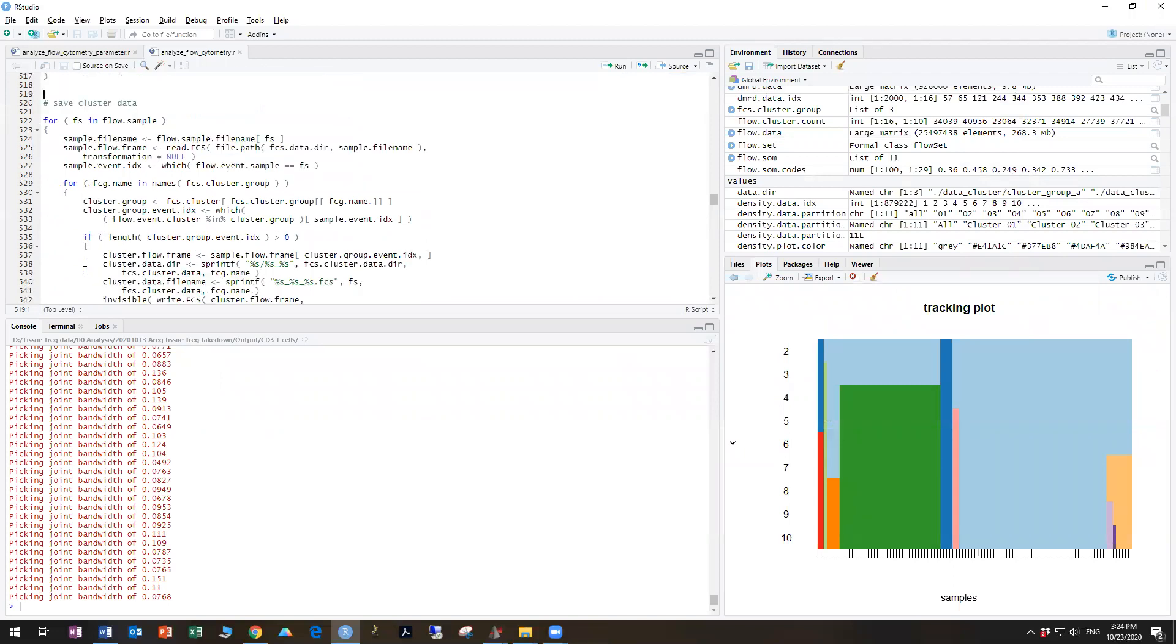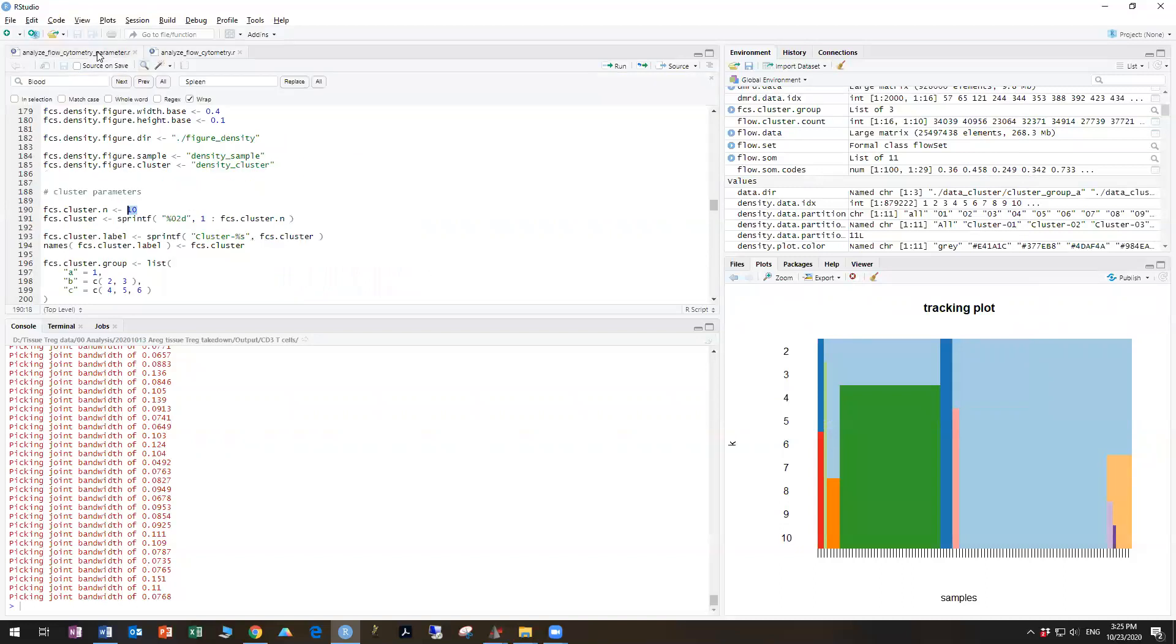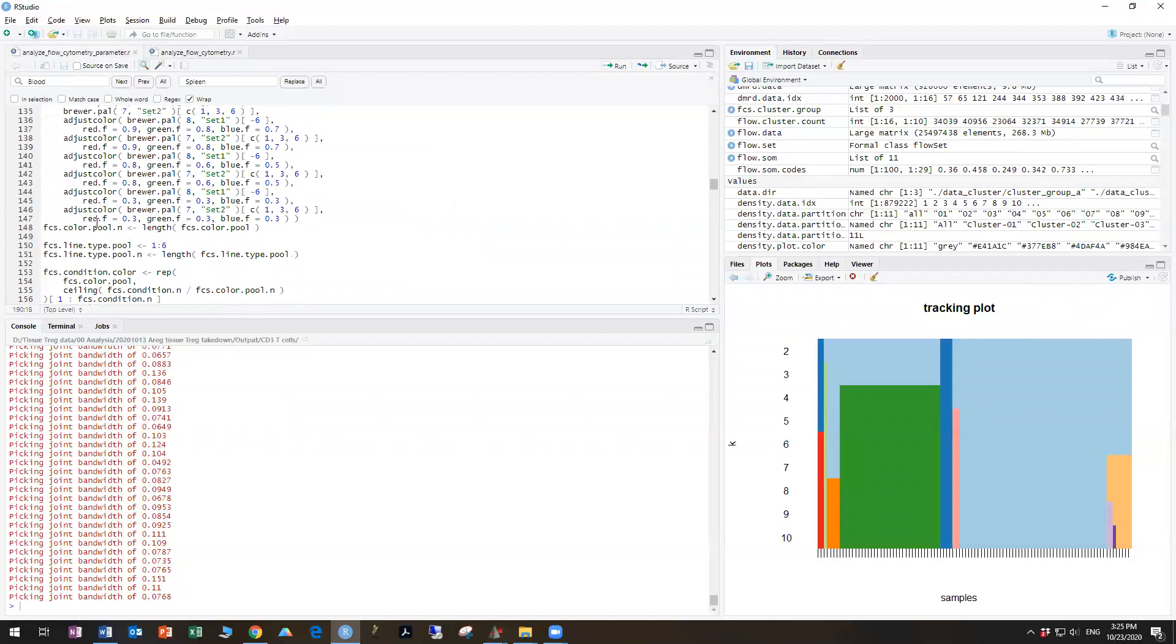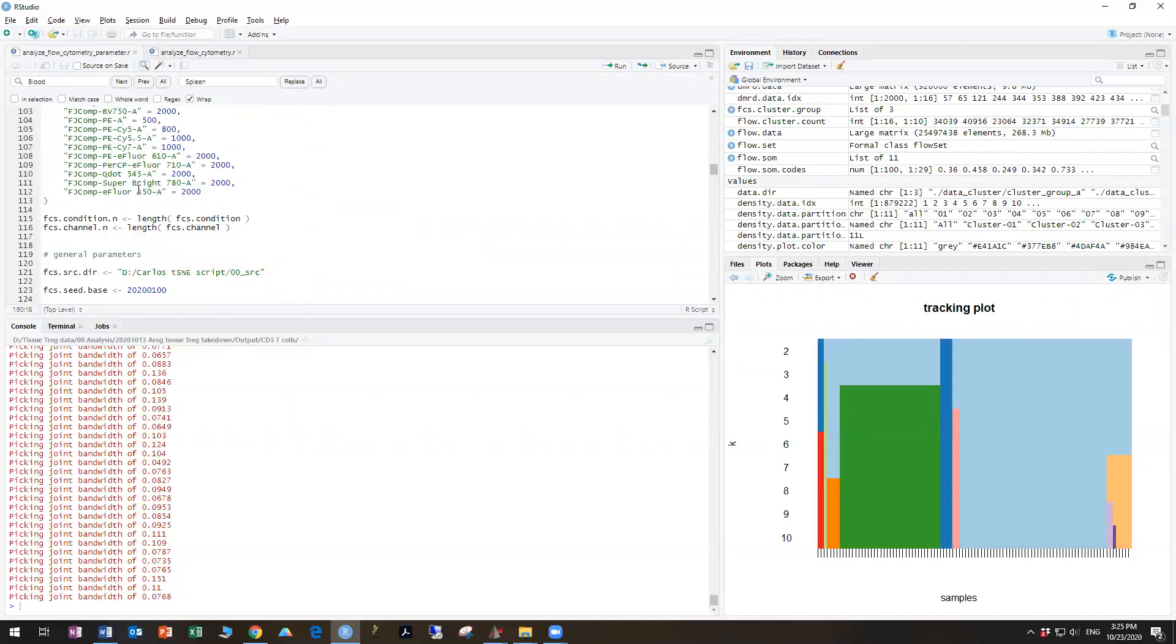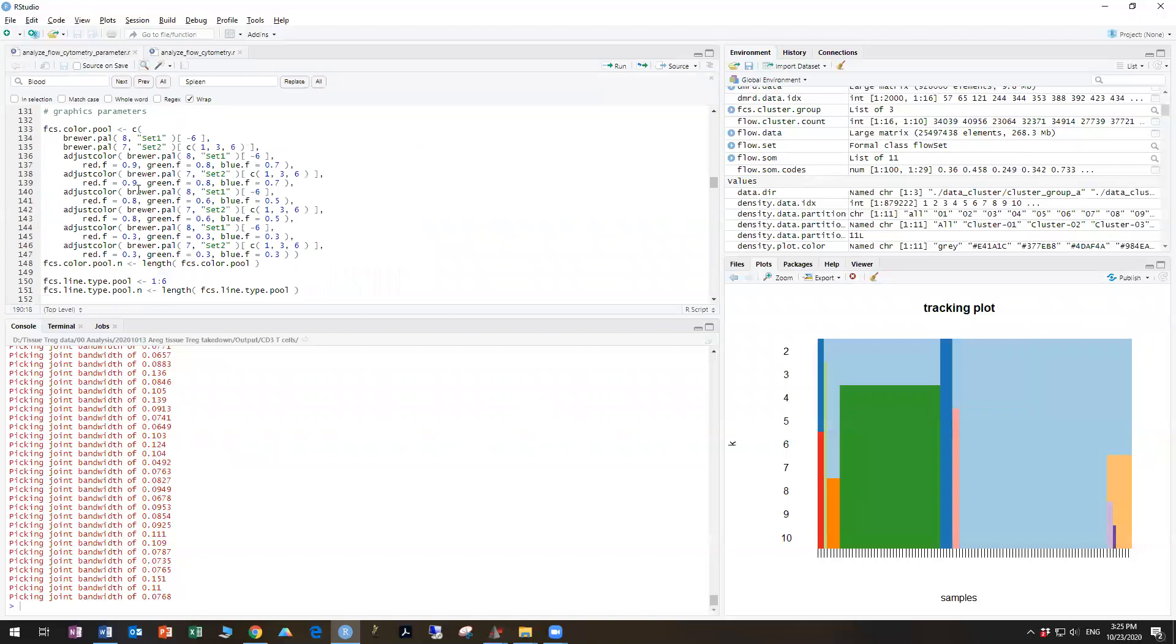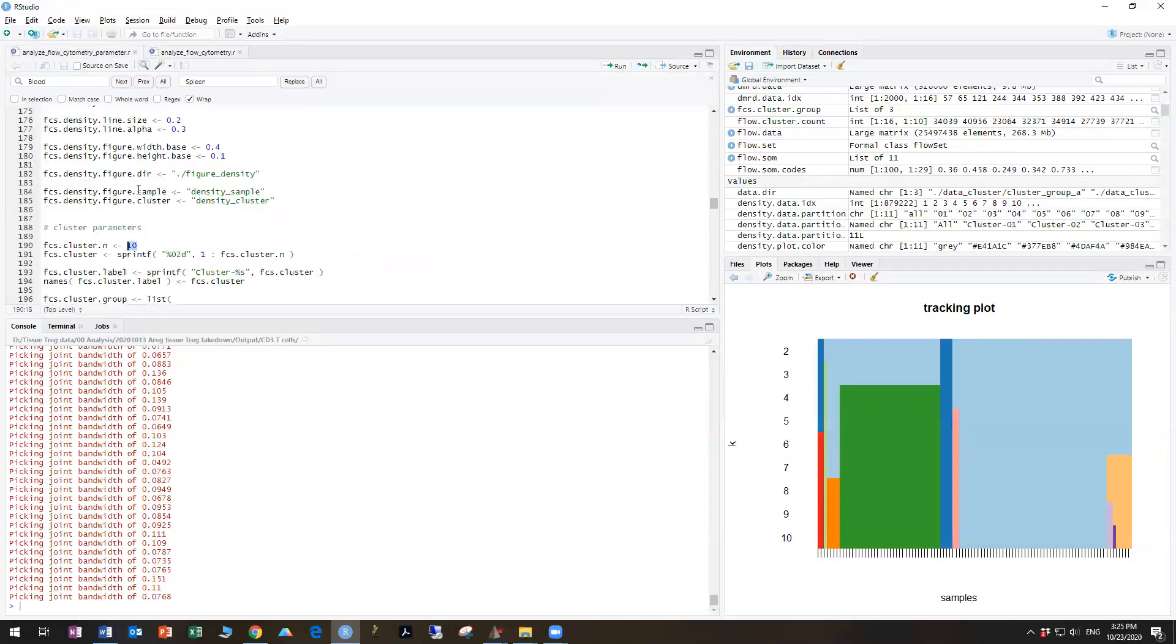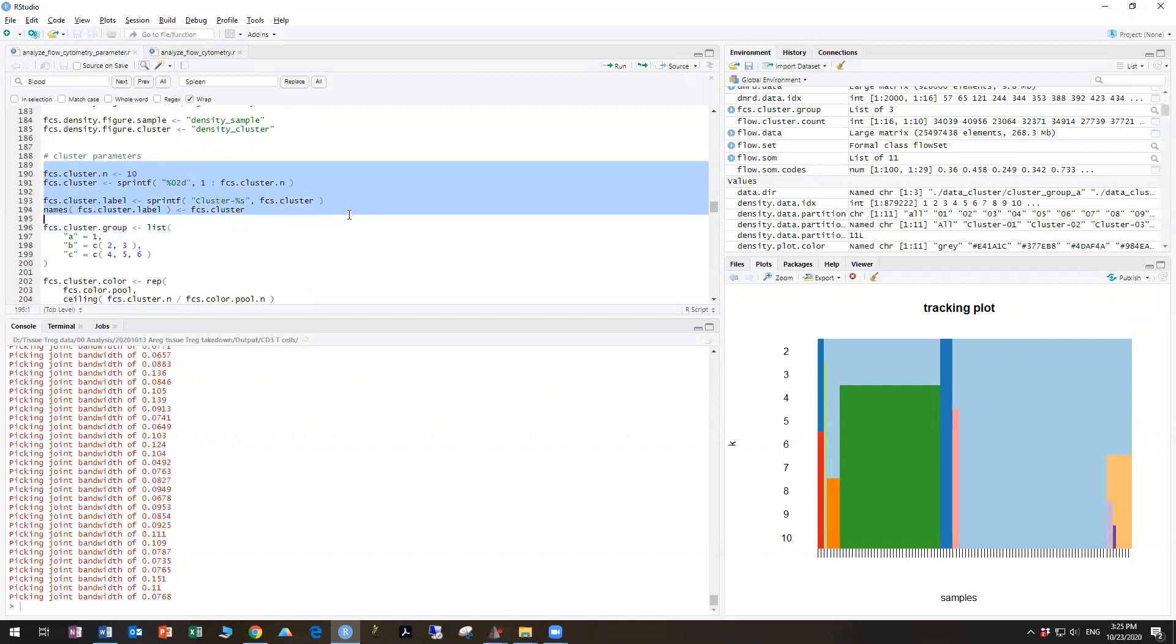All right. Now what we should do at this point is go back into the parameter file, if we are satisfied with the clustering, and name these clusters. So rather than calling them clusters one through 10, we can actually name them specific clusters. So you can see this is the part here where the clusters are being named.